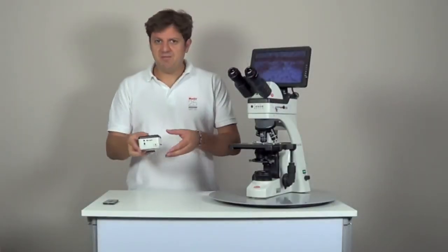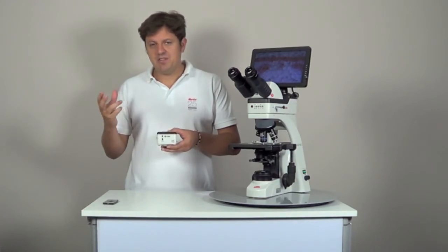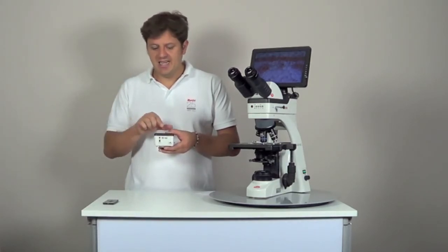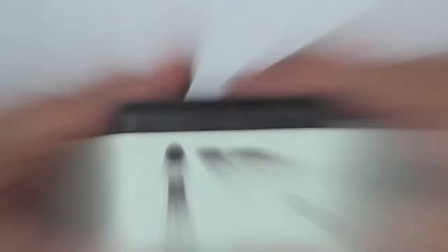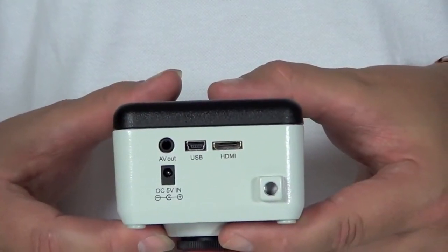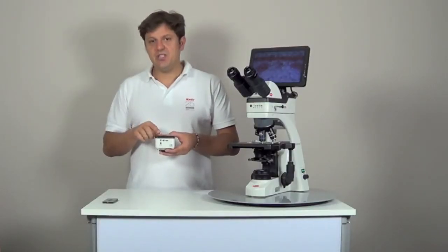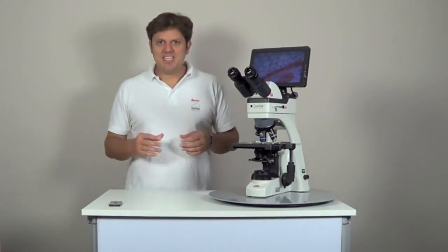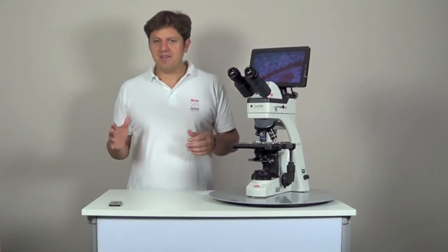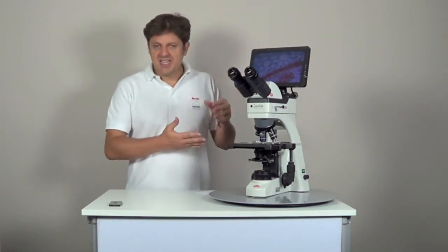The Maticam 580 also has an analog output to connect it to analog monitors. However, this technology is getting outdated and HDMI is becoming the new standard. There is also a USB connection to connect it to a computer just like standard Maticams; in this case the resolution is identical to Maticam 1. The Maticam 580INT has exactly the same technical characteristics as the Maticam 580 but it is meant to be integrated into our BA Elite microscopes.